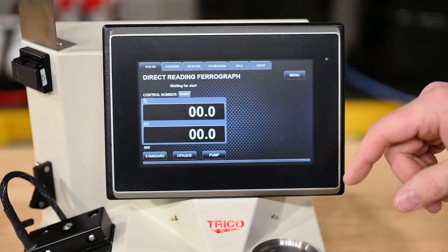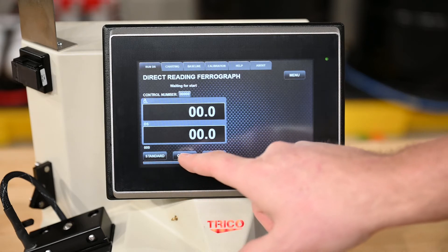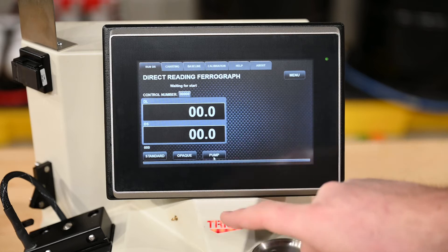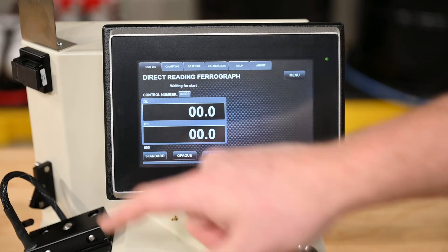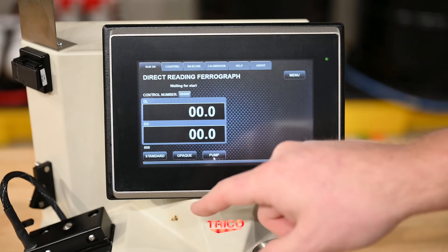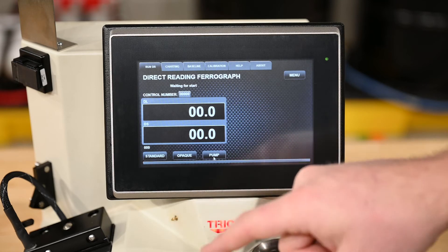Back on the home screen, we have the Run DR tab, which you can run standard, opaque, or simply pump. If you select pump, it pumps fluid through and helps drain if it needs to be drained. If you select opaque, you run it opaque. If you select standard, you run it as a standard run.